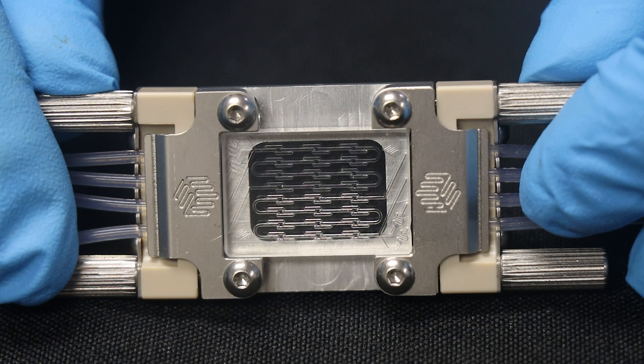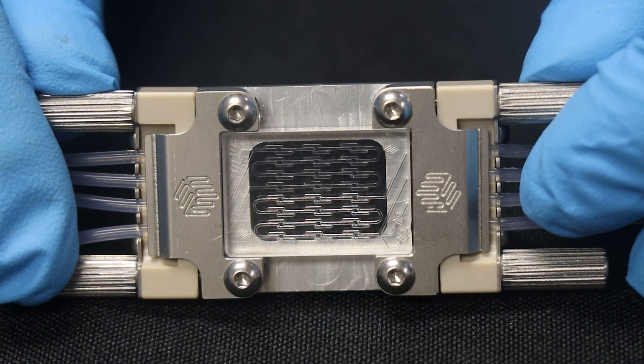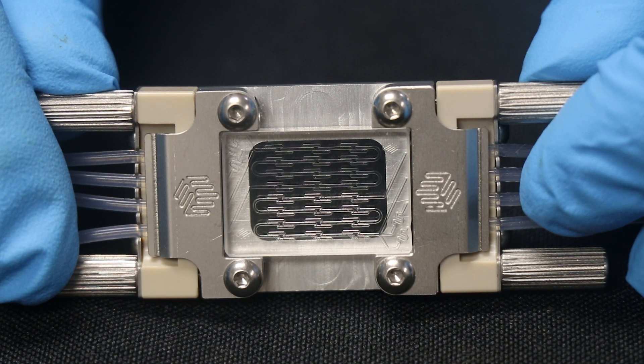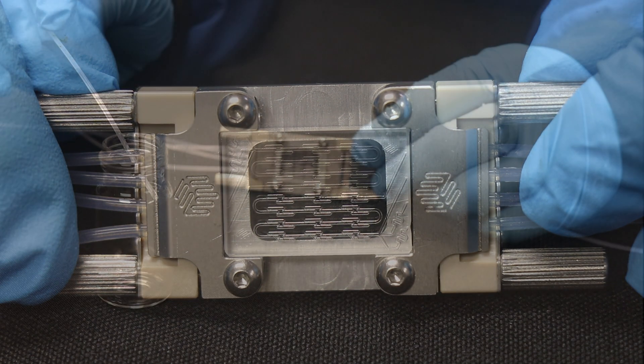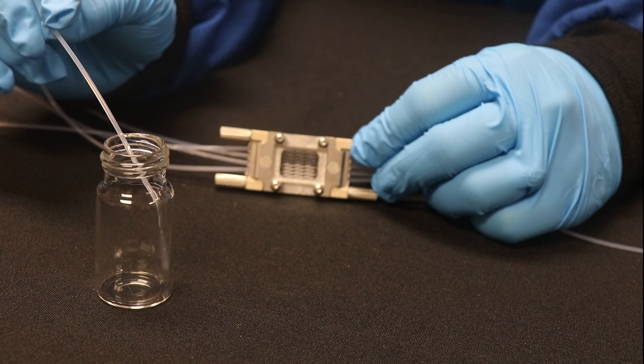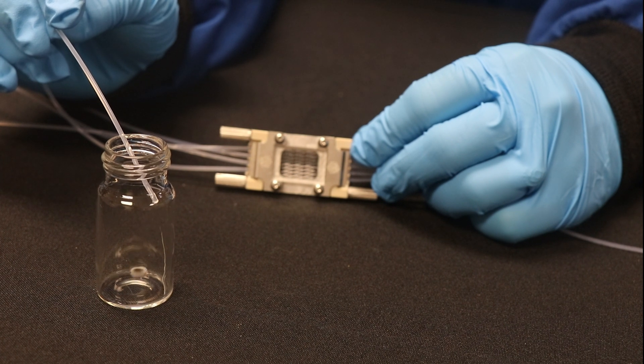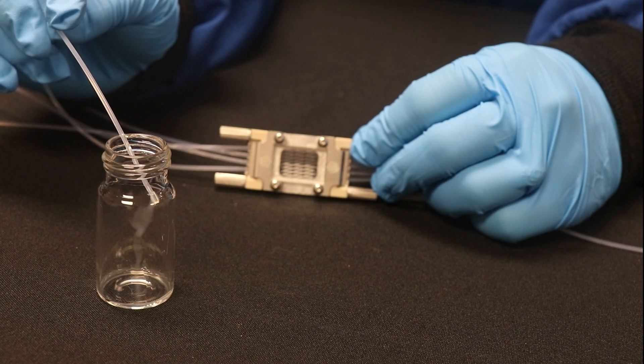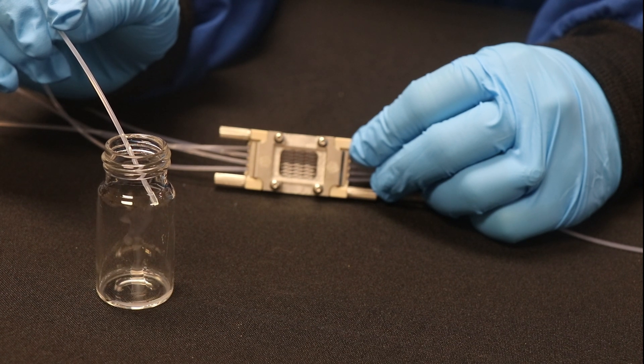Other common processing parameters include total flow rate through the system and flow rate ratio, which refers to the ratio of the aqueous to organic phases. The process you see here has a flow rate ratio of three to one and a total flow rate of about one milliliter per minute. The resultant product contains lipids at 12 milligrams per milliliter and 25 percent total ethanol.